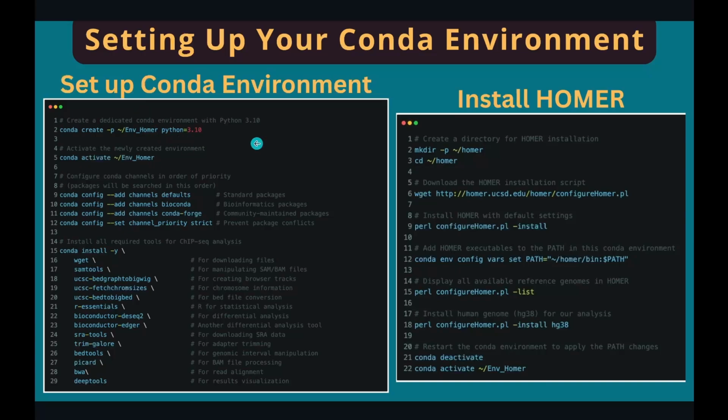So just open your terminal, create a new environment called env HOMER, activate the new environment, set up all the channels, and install the tools using conda install. -y means yes to all. No need to take notes. Everything is on my website, ngs101.com.